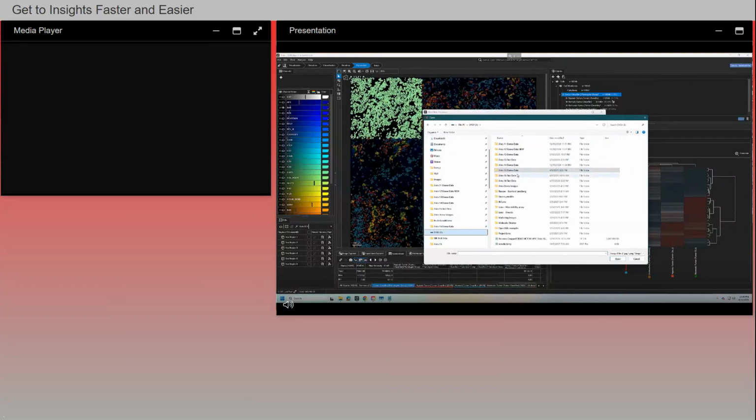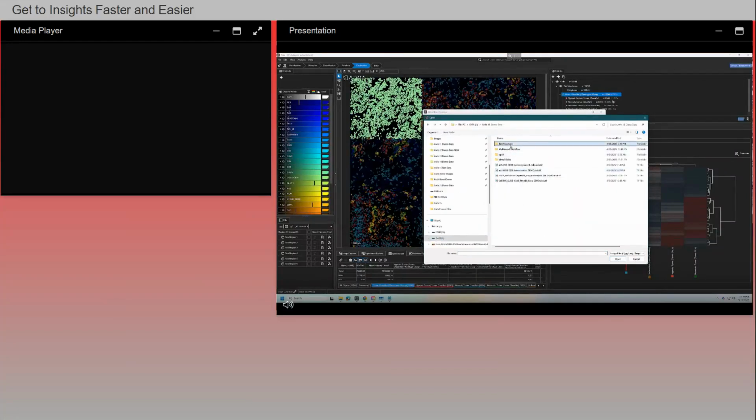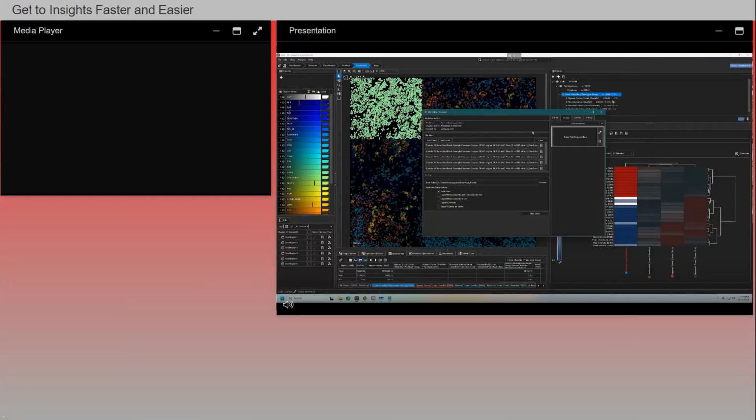So for example, in this particular workflow, if I selected these 5 images, it will just run the batch analysis in sequence, exporting measurements, summary tables, as well as CSV, and all the channels if I choose. I can run this, which takes a few minutes. This is essentially how you do batch analysis from everything, including detection, classification, and spatial relation analysis in Aivia. If I were to press go, it will just run on its own for under 10 minutes and give you the output you're looking for.